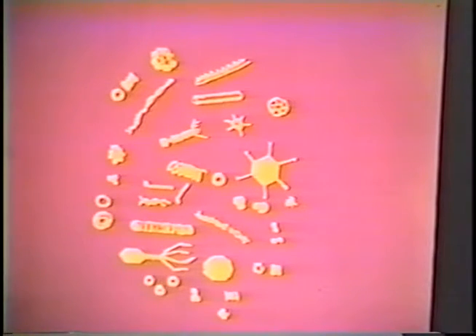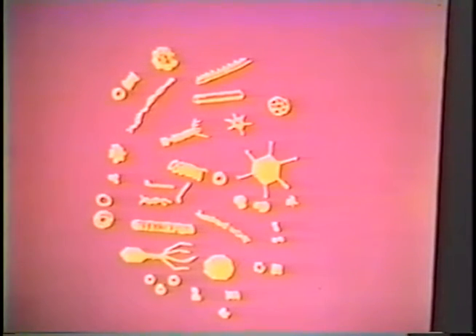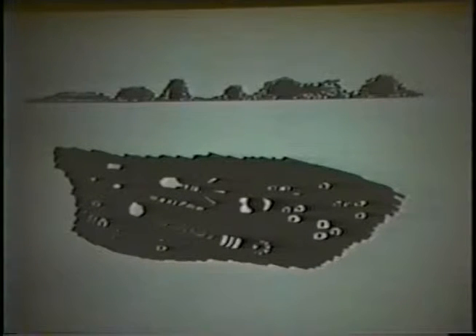Again, not interacting with our biological material, surrounding, penetrating, and revealing. We have several negative stains, so in our model we can again use a different color to represent the surrounding contrasting material. And as a final example, a blue negative stain shows essentially the same thing. At the top we have biological material supported on a carbon film and surrounded by negative stain.